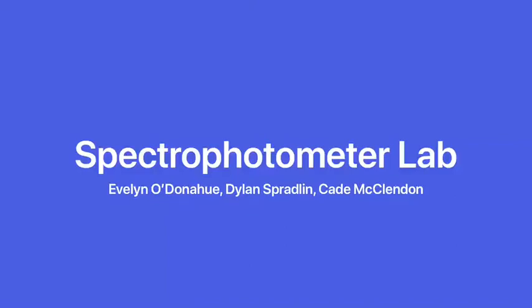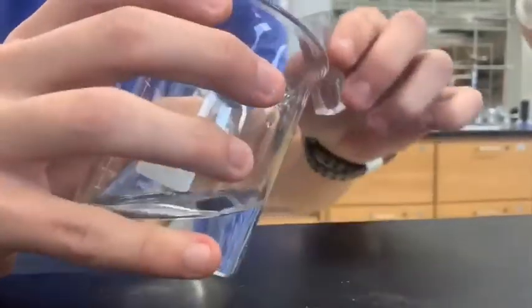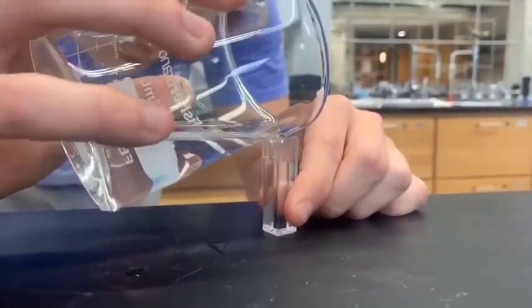In today's video, you're going to learn how to use the spectrophotometer and its results to determine the concentration of several solutions as well as an unknown. Let's get started. Before using a spectrophotometer, a set of dilutions with gradually decreasing concentrations should be made, as well as a sample of your unknown and a blank solution.